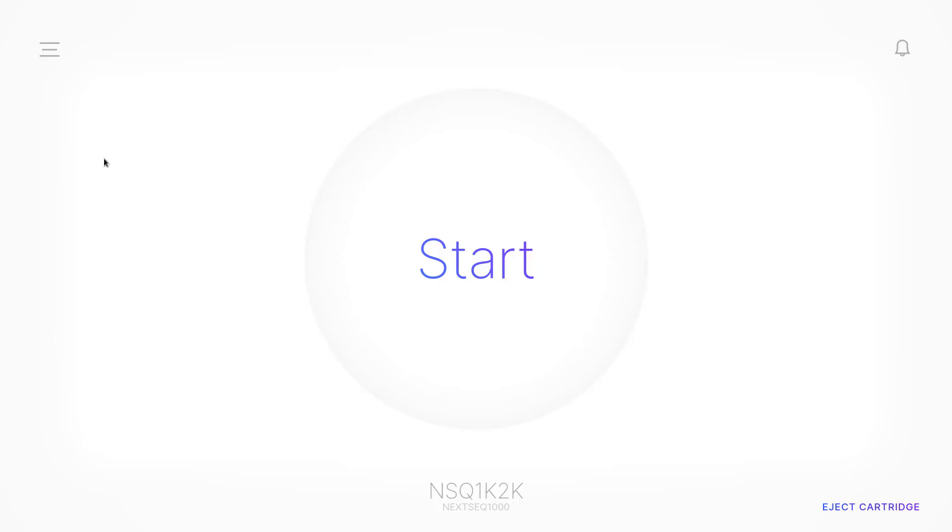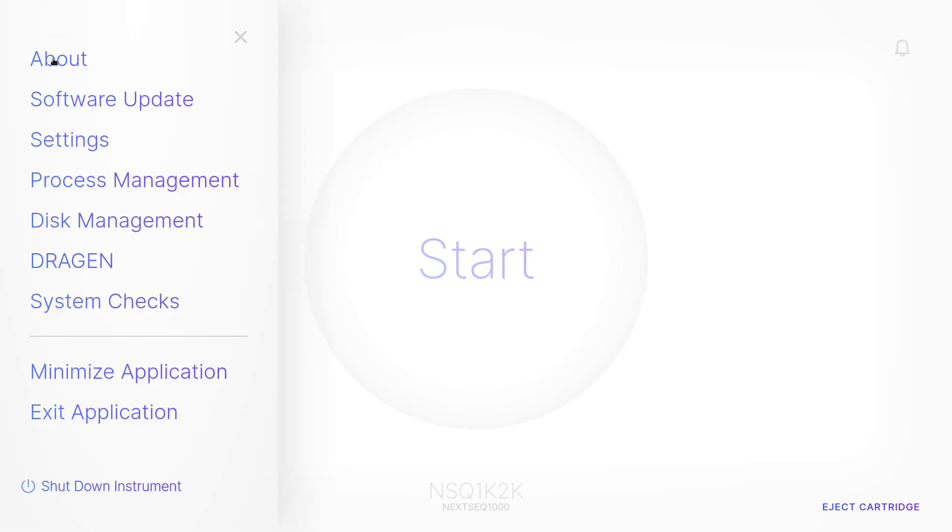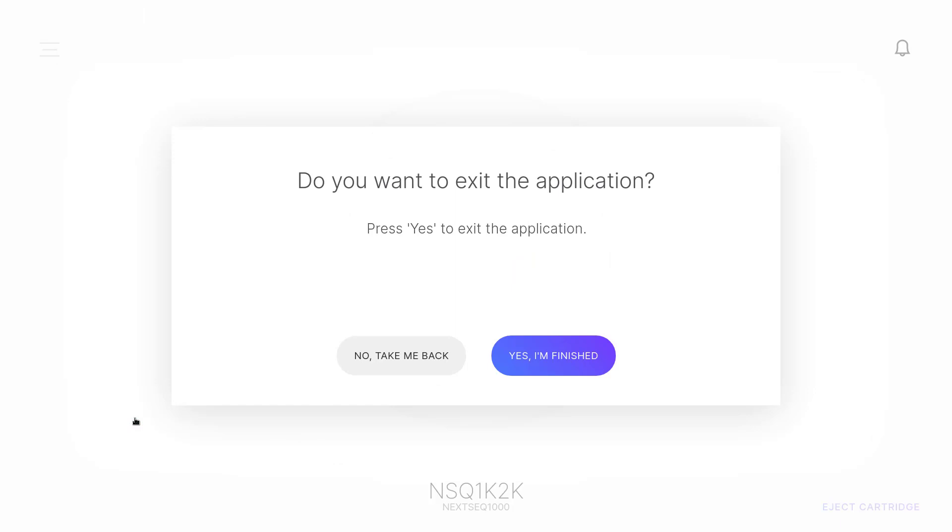First, close the control software through the hamburger menu, select Exit Application, and then select Yes, I'm finished.